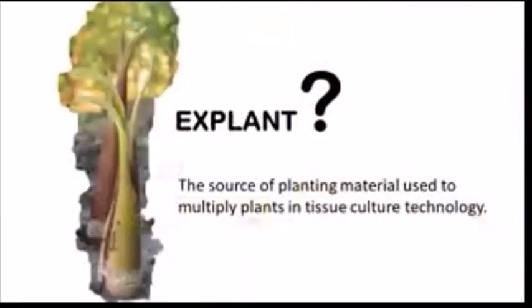Okay. Do you know what explants are? For tissue culture laboratory staff, this term is familiar. Explants are plant parts which are propagated by tissue culture.